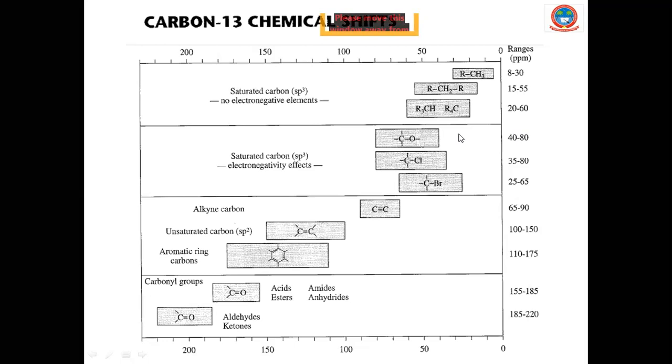And those carbons which are not having directly attached hetero atoms, so usme kya dekhenge hum? We can say that such carbons which are not having the hetero atom, jisko nahi rehta hai, unki range kya hoti hai? 55 ya 50, means below 50 hoti hai. Ye practically to 50 ke niche aata hai, phir bhi in extreme cases it goes to the 60, but not more than that.